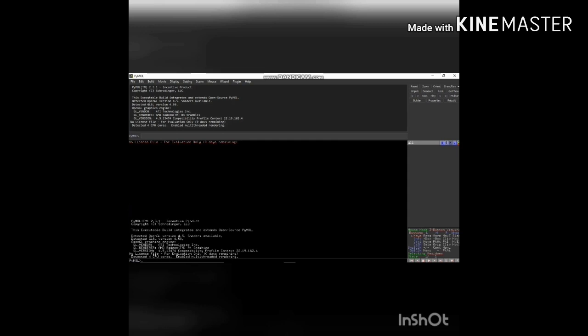This is the home page of PyMOL. The tool contains three windows: the top window is the upper control panel, the bottom window is the command line, and the right side window is the object menu panel. It contains options like show, label, color, and active. You can choose any option to alter your structure, and the bottom is the movie control panel.